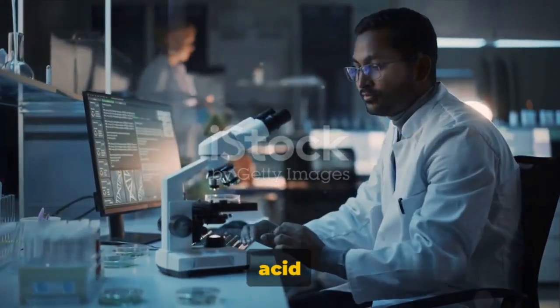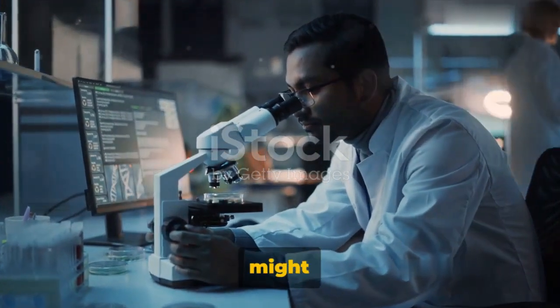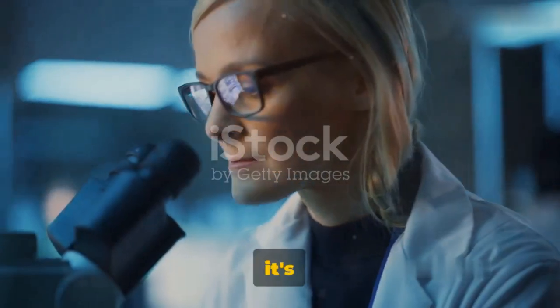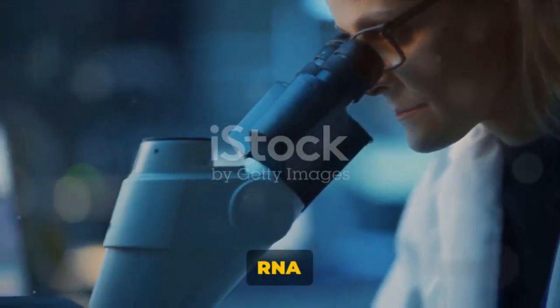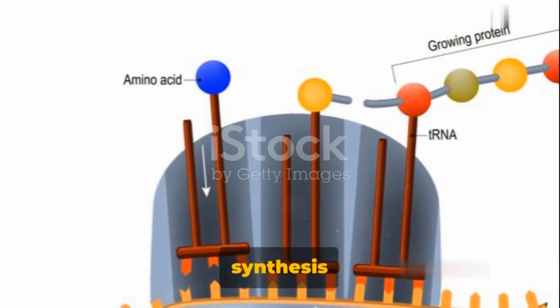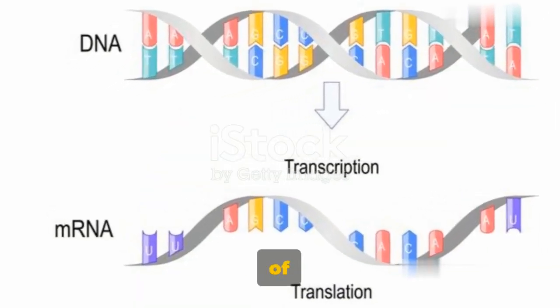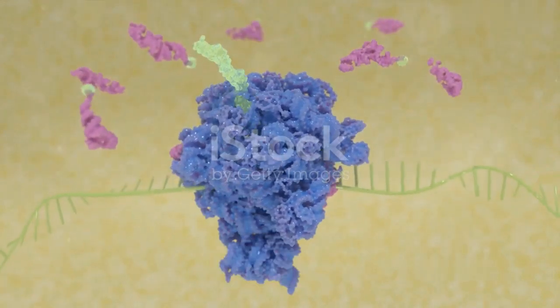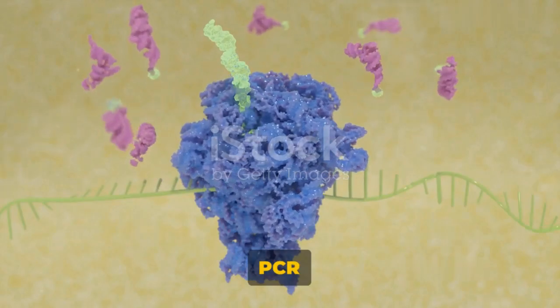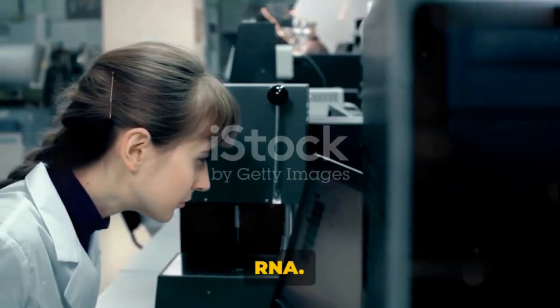Firstly, the nucleic acid sample. In RT-PCR, RNA is the sample. Now, you might be wondering, why RNA? Well, it's mostly because the majority of the time we're dealing with mRNA. This type of RNA is the blueprint for protein synthesis in cells. By analyzing mRNA, we can get a snapshot of the genes that are active at any given time in a particular cell or tissue. Now, unlike other PCR techniques that use DNA as their sample, RT-PCR uses RNA.